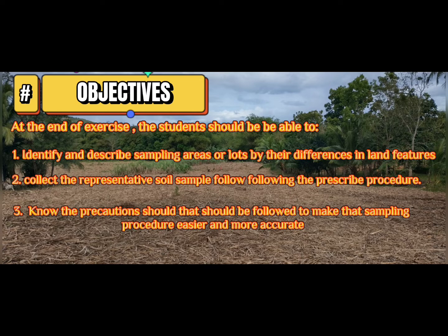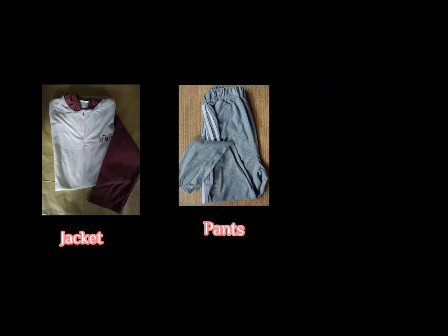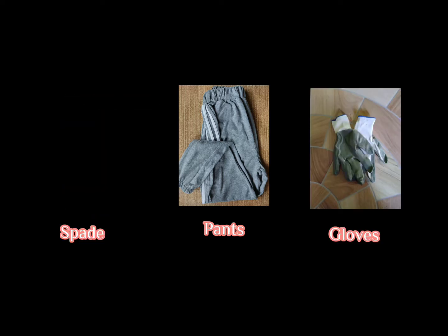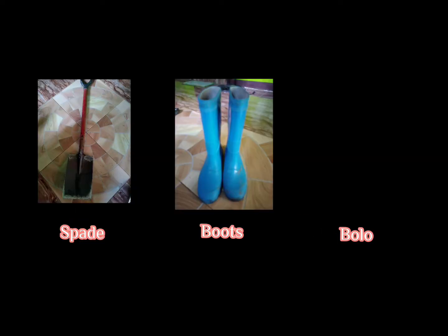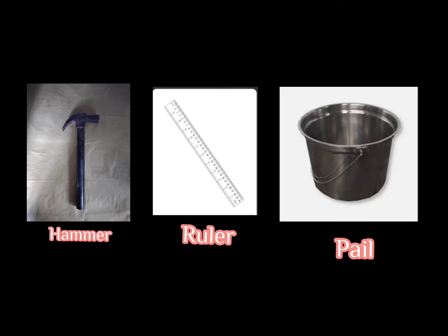Compare differences in land features. 2. Collect the representative soil sample following the prescribed procedure. 3. Know the precaution that should be followed to make the sampling procedure easier and more accurate. And for the materials: jacket, pants, gloves, spade, boots, bolo, strainer, marking pen and paper, plastic bag, hammer, ruler, pail.